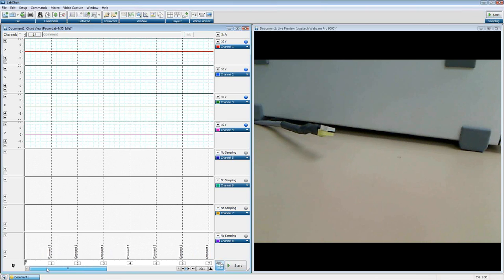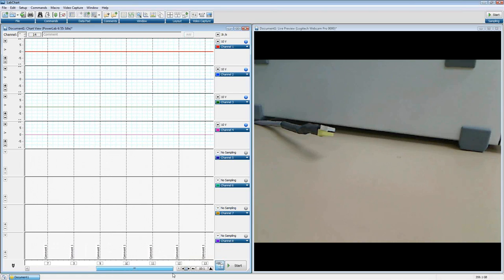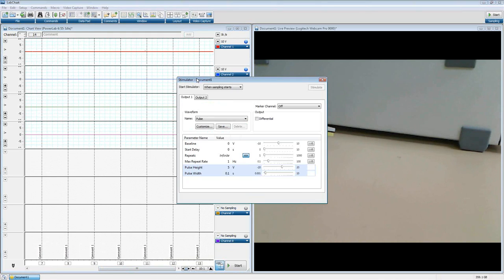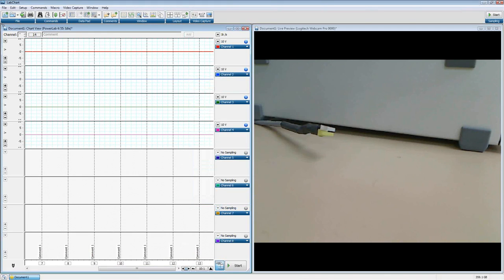And you can see here, all the comments are occurring. We got a slight little bit of software lag, very, very small, 1 millisecond, exactly at 1 hertz. So they're responding to that signal coming in. If you don't believe me, say, oh, that's automated, here's what I'll do: I'll set up the stimulator. I'll set it to trigger manually. I'll bring open the stimulator settings, the stimulator panel.